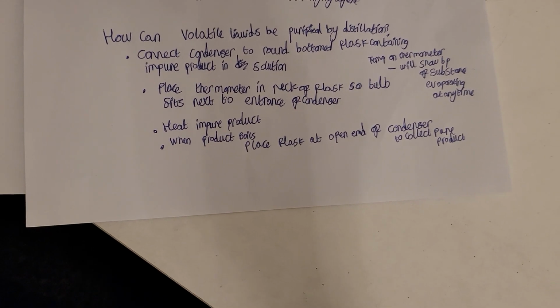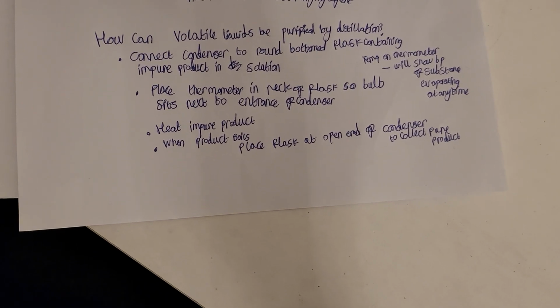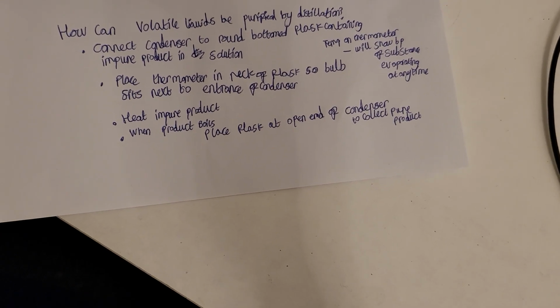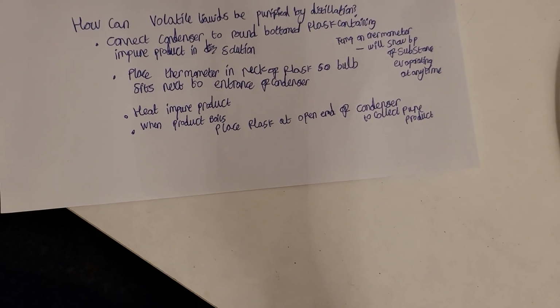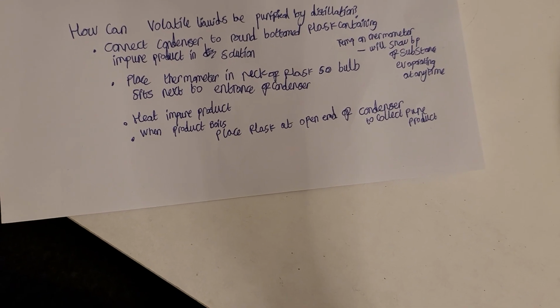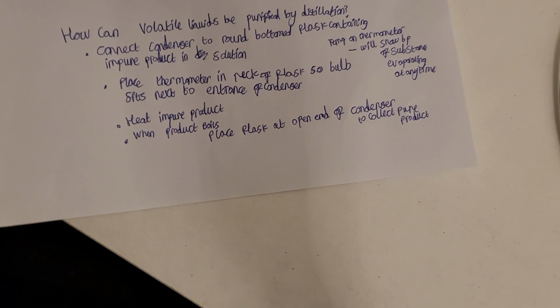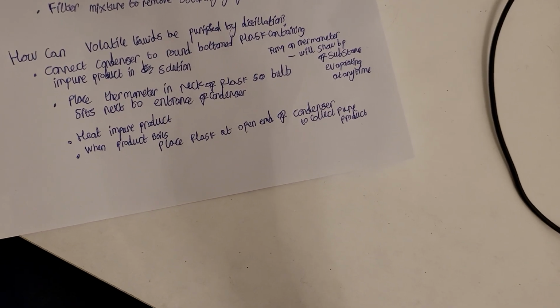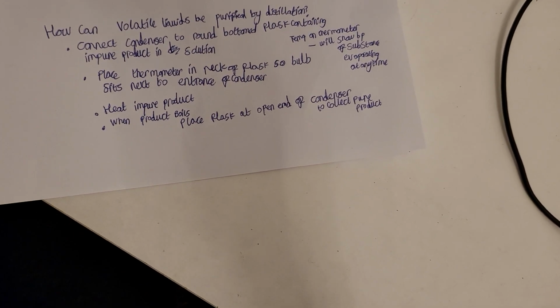heat the impure product, and when the product boils, we'll place a flask at the open end of the condenser to collect the pure product. Place a flask at the open end of the condenser to collect the pure product, and the temperature on the thermometer will show the boiling point of substances evaporating at any given time. What does the temperature on the thermometer show? It shows the boiling point of substances evaporating at any given time.